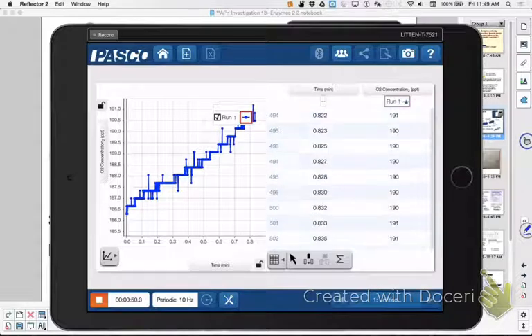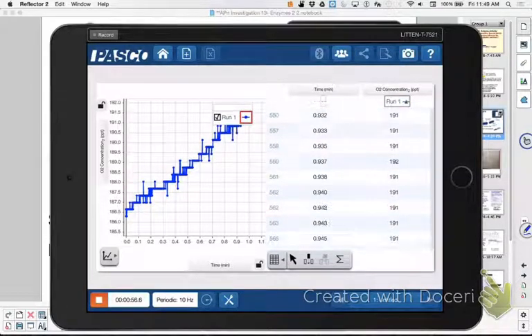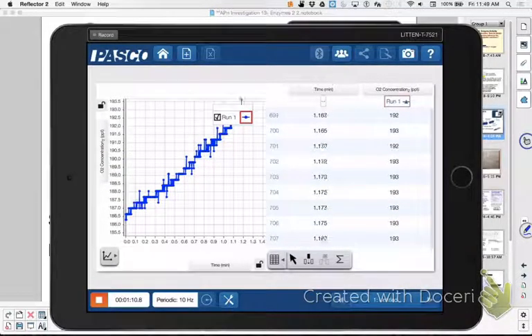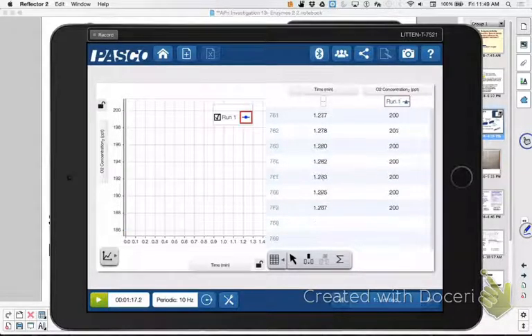I'm gonna take some water. 2.5. And a 1/2 ml of enzyme. I've got it ready to go. Okay, now I'm ready to stop. So I'm stopping it. Did I go 3 minutes? No. How many did I go? 1.2. 1.28.